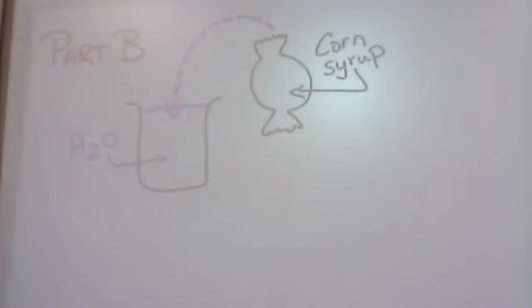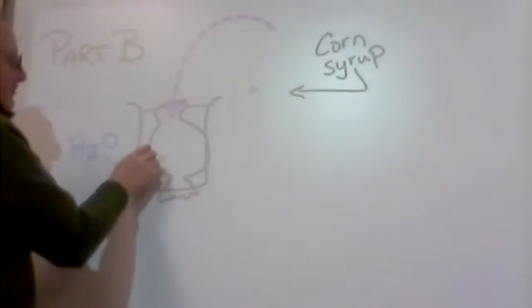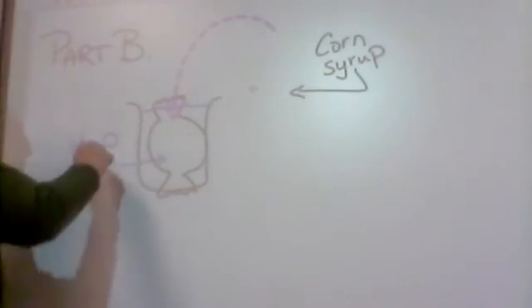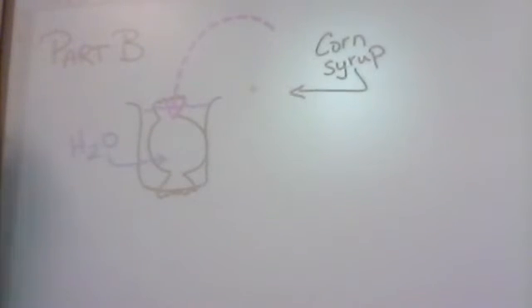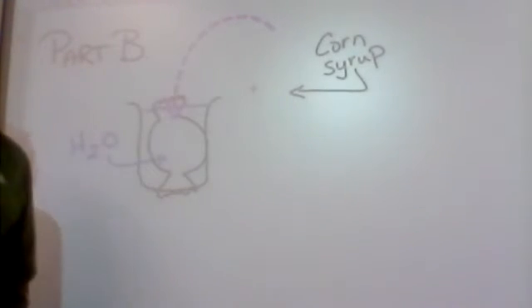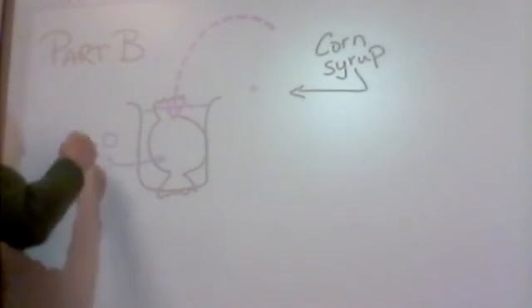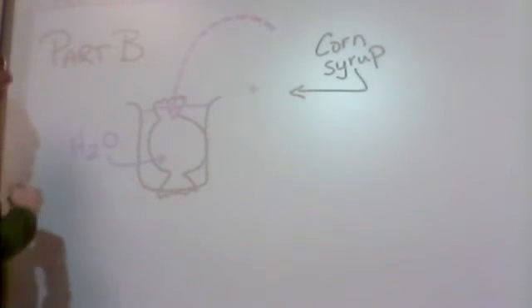I think we take, drop this in there. Is water going to move into it? Is water going to move out? What do you mean, water? Like water. Corn syrup has a lot of water in it. So it will have it.